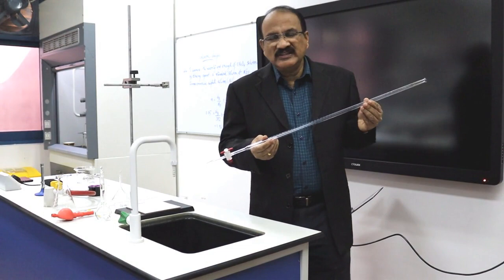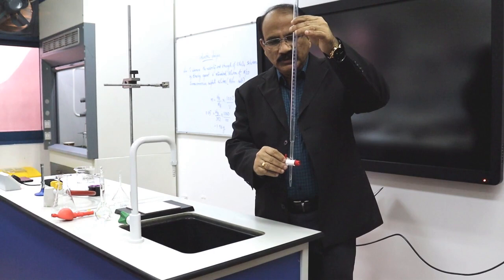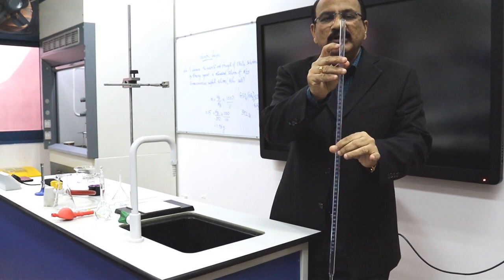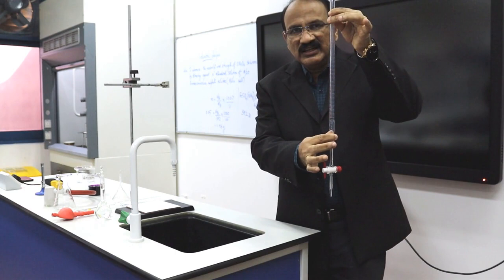The apparatus needed for this experiment. The first one is a burette. This is called a burette. The capacity of the burette is 50 ml. It starts from 0 ml and ends at 50 ml.